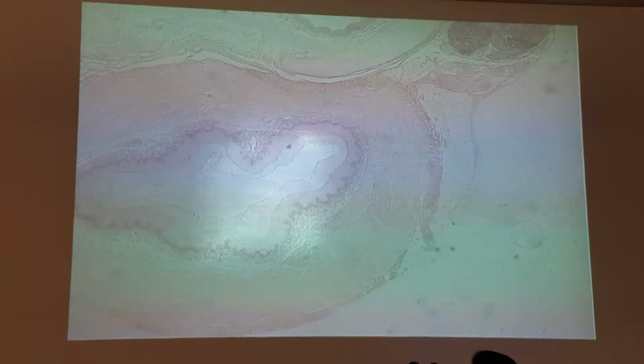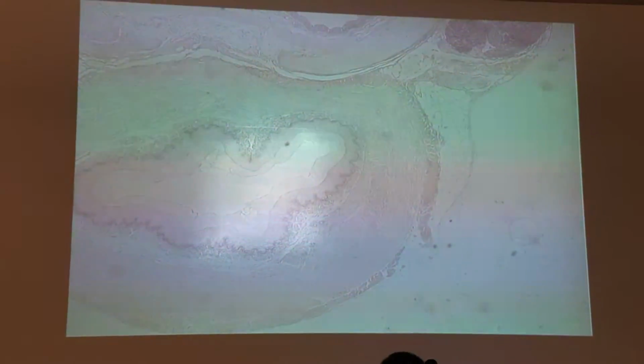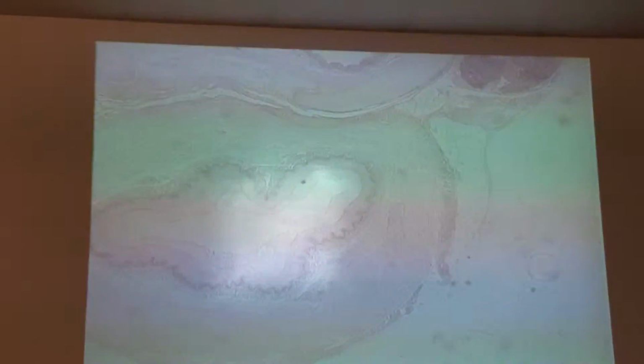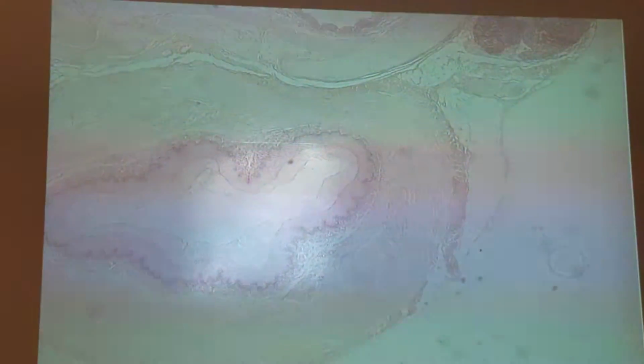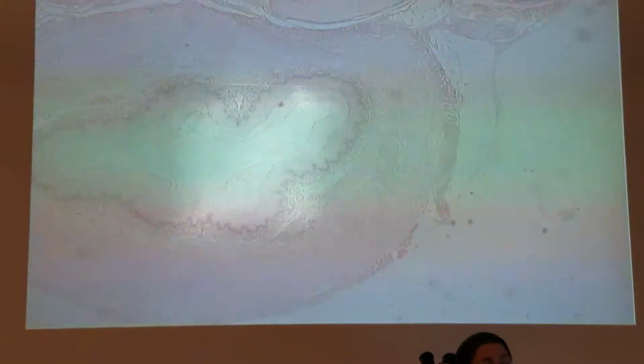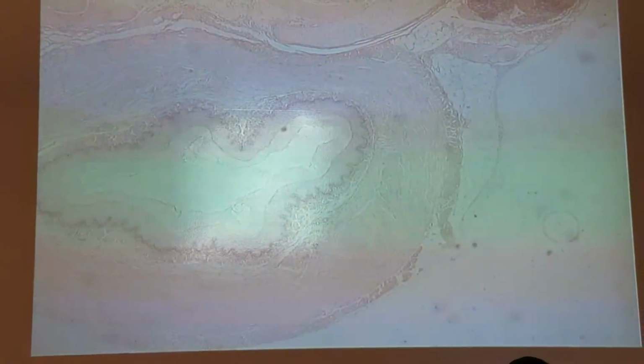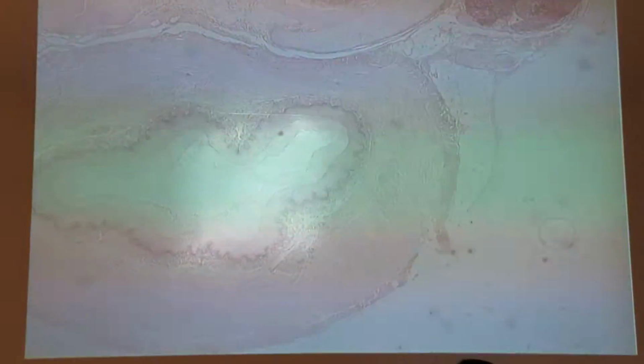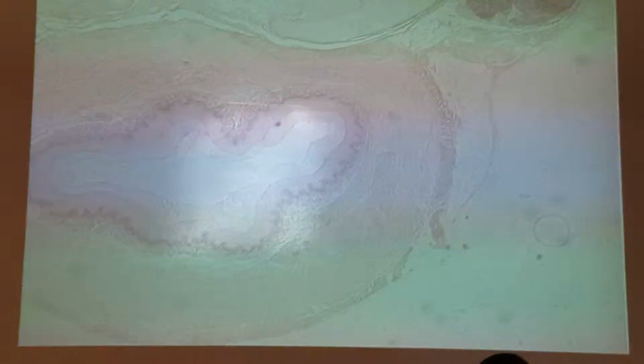Behind the trachea is the esophagus. There's our esophagus. So the esophagus is also going to follow the same types of layers that our stomach and colon and the ileum are going to follow. So the mucosa, submucosa, muscularis externa, and adventitia. In each one of those layers there is going to be a structure, except for the submucosa. It's just submucosa. So don't worry about connective tissue and blood vessels. You won't be asked anything like that. Bare minimum would just be pointing at the layer and you choosing submucosa.